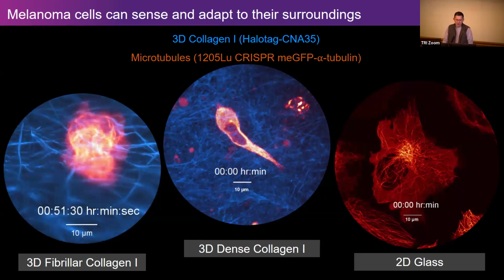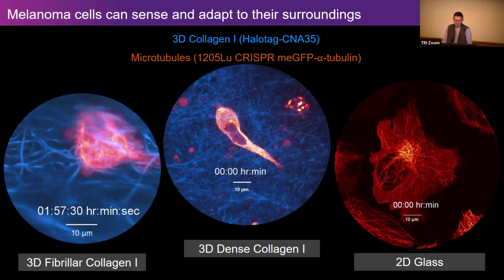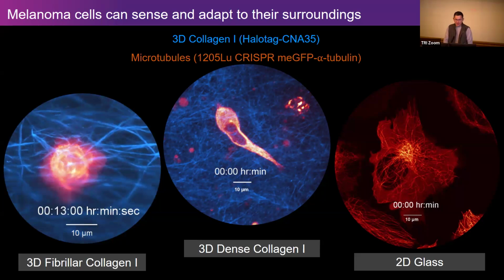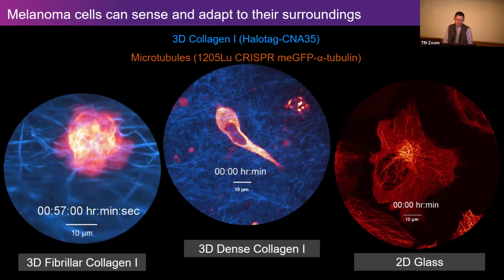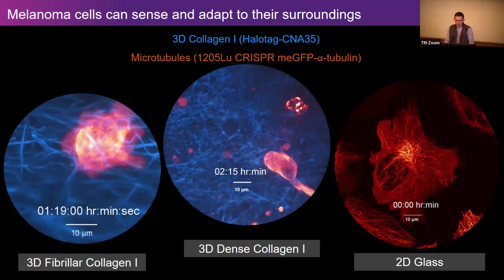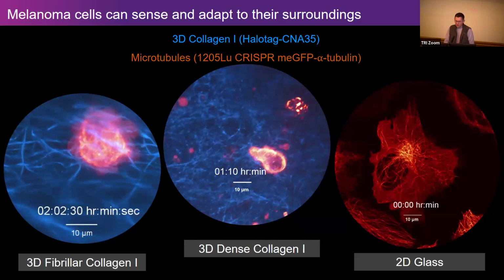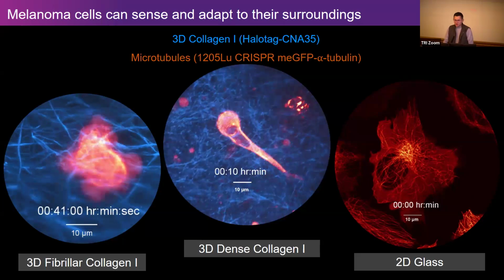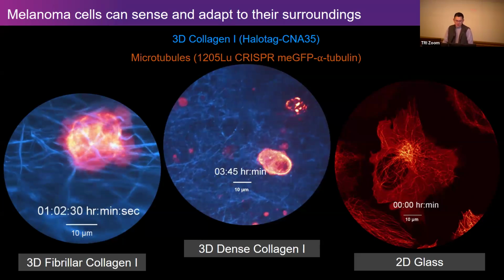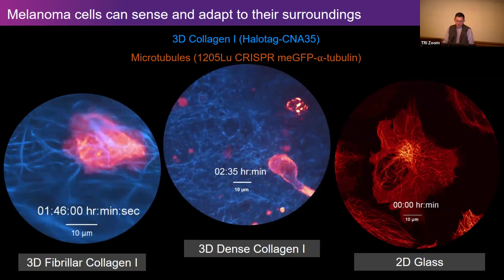And what you can see the cell doing is it undergoes this predominantly bleb-based motility that we call amoeboid blebbing. It's a very efficient, fast blebbing motility that uses local hydrostatic pressure gradients to progress. The classical one that many of you may or may not have seen is this one where cells undergo mesenchymal motility, where they extend a primary pseudopod and use proteolytic degradation mechanisms to gore out holes within the 3D hydrogels to progress motility.